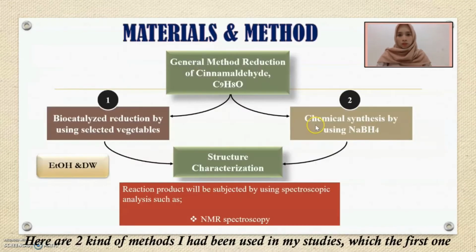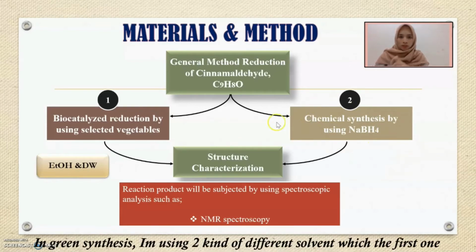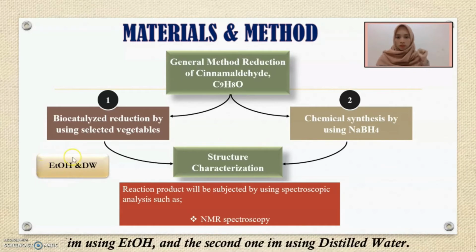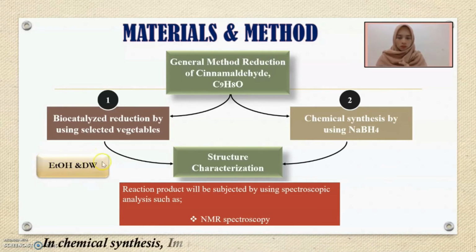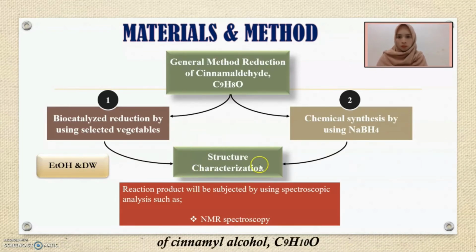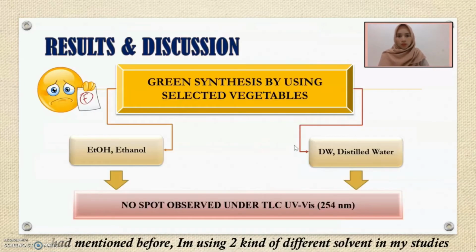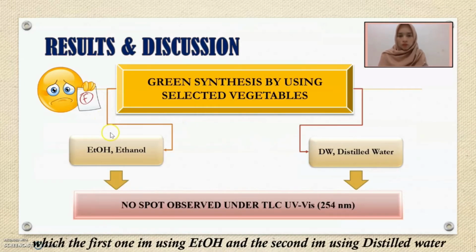Here are the two methods used in my studies: green synthesis and chemical synthesis. In green synthesis, I'm using two different solvents: ethanol and distilled water. In chemical synthesis, I'm using sodium borohydride to isolate the pure compound cinnamyl alcohol, C9H10O.